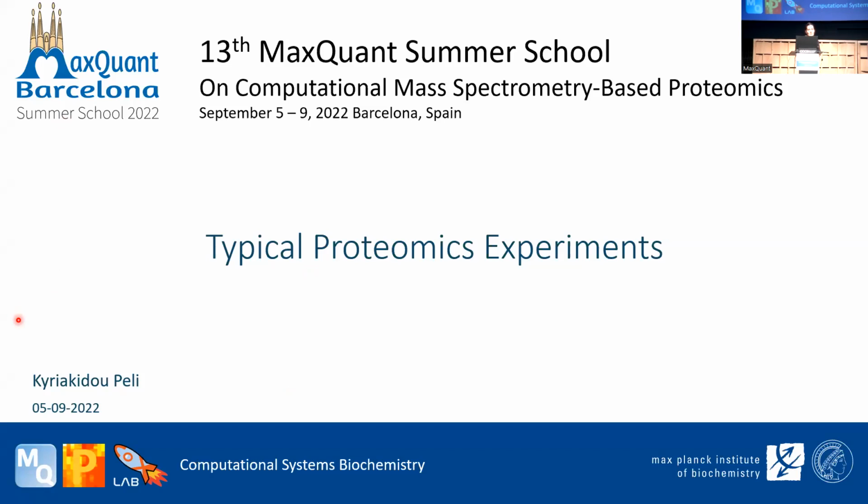I'm going to talk about 2 different topics. First is going to be about typical proteomics experiments, and then we're going to talk about some basics of the MaxQuant software. So yeah, we thought it's a good idea to start the summer school with something quite basic.